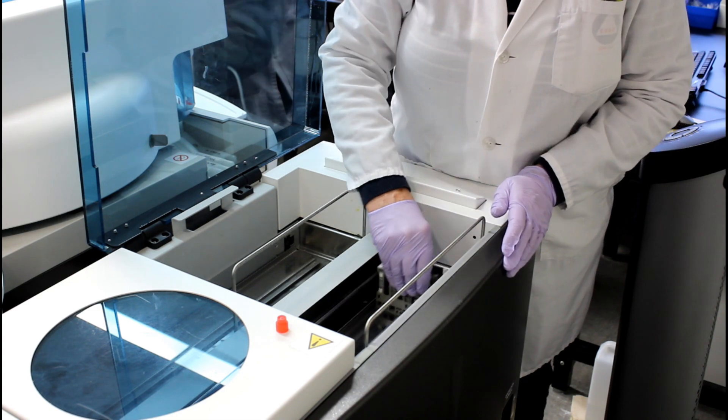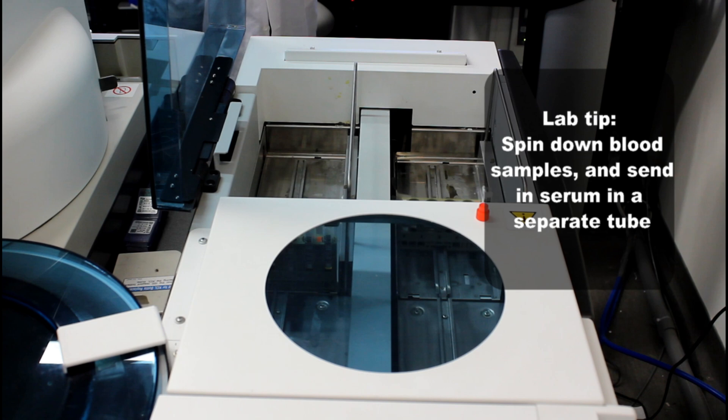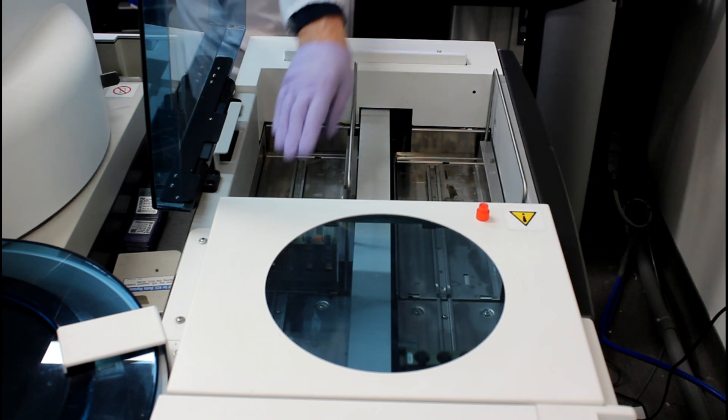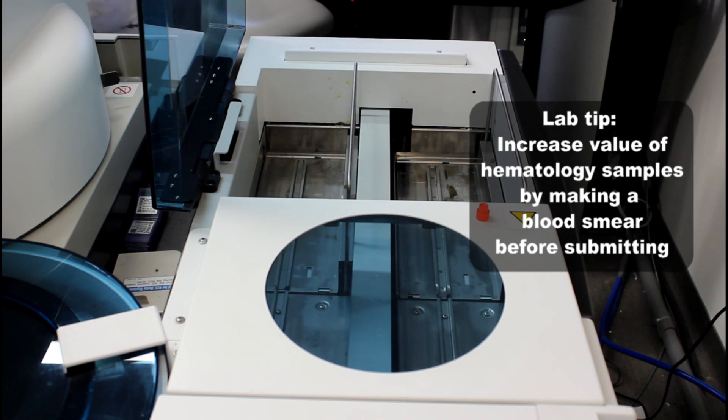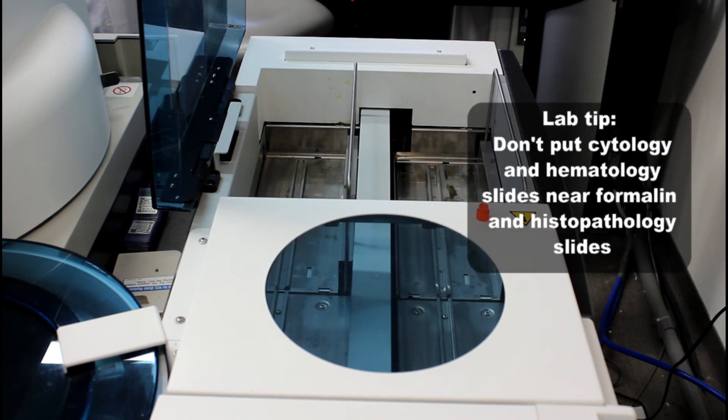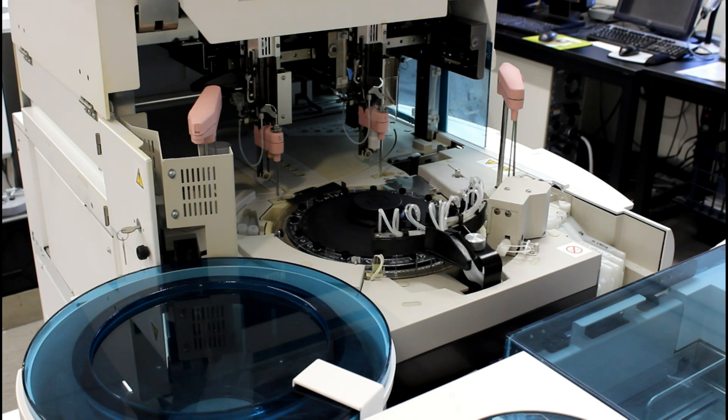One quick tip to remember is with whole blood samples to spin down your blood and send in serum in a separate tube. Additionally, you can increase the value of your hematology samples by creating a blood smear before submitting. Another tip is to not put cytology and hematology slides near formalin and histopathology slides. They can be fixed and rendered not useful. Send them in separate containers.